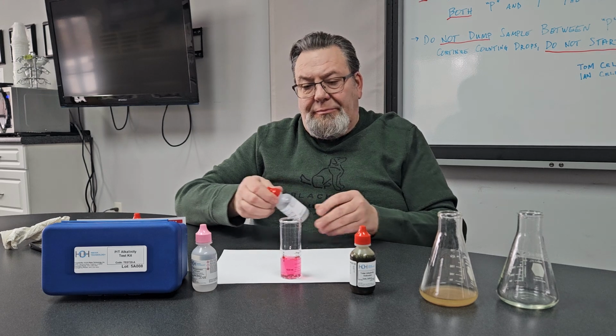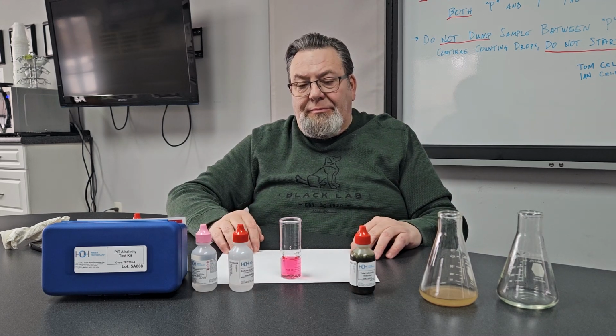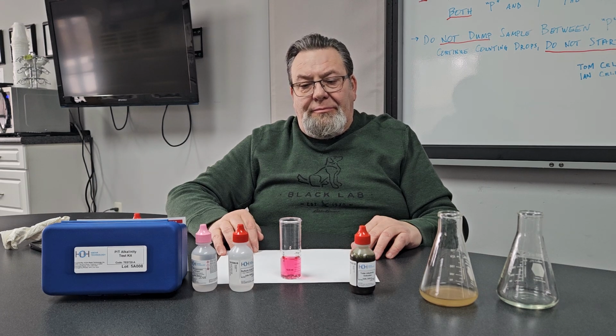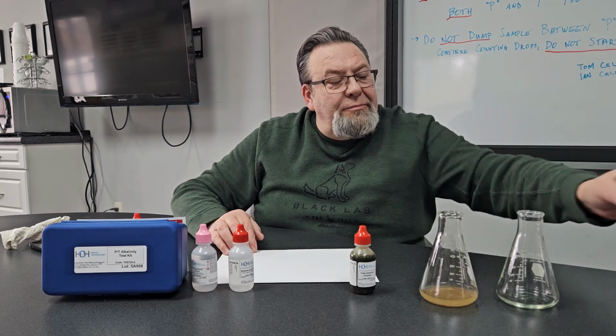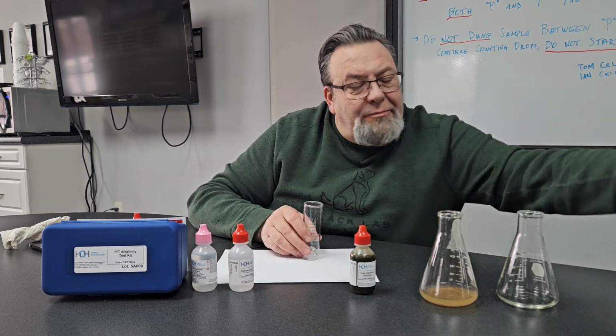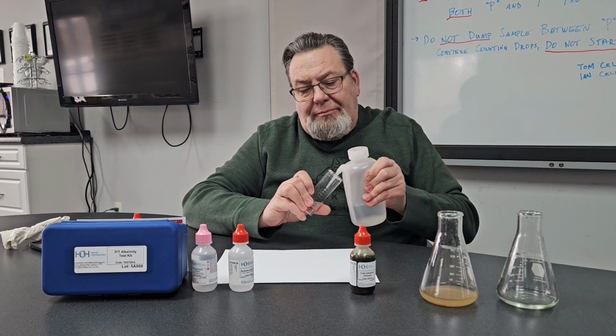8 times 50 parts per million is 400 parts per million as T alkalinity. You'll enter this number into the cloud reports. The cloud reports will automatically calculate the OH alkalinity for you. In this case, your OH alkalinity would be 200 parts per million, following the formula shown on the instruction card.